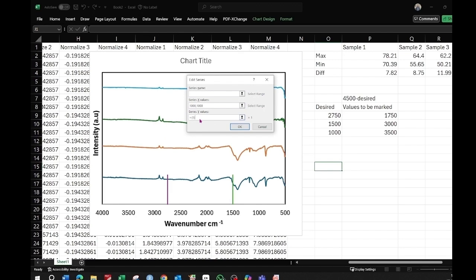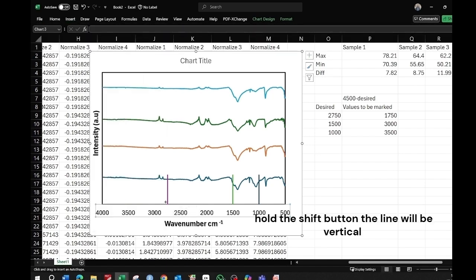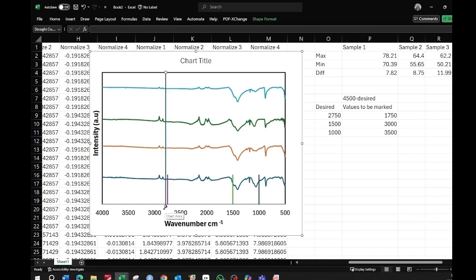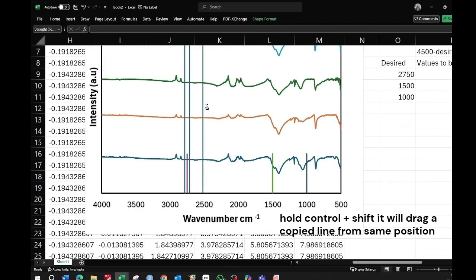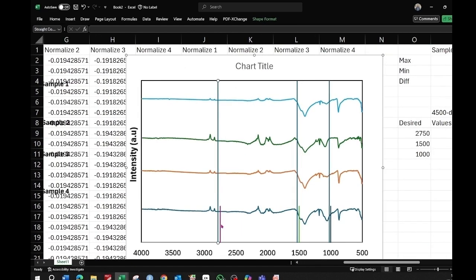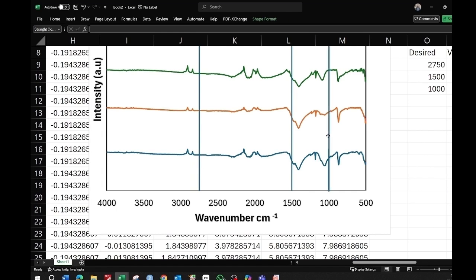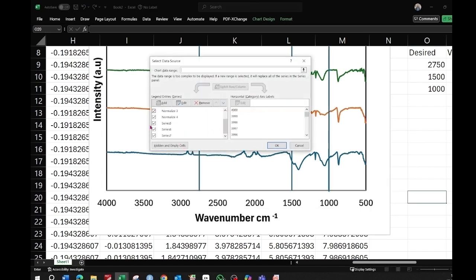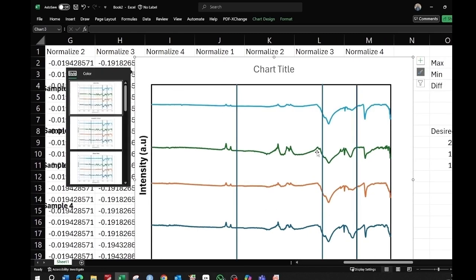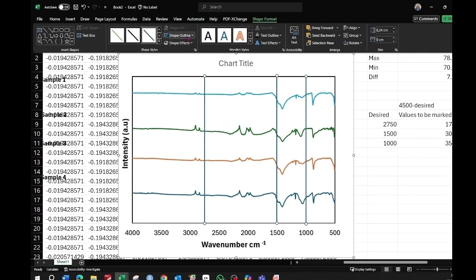Go to Insert, choose the Shape option, select the single line, and drag it vertically while holding the Shift button to keep it straight. Zoom in to confirm your line starts from the axis. Press Ctrl+Shift and drag to copy lines to all three positions. Select each line and drag it to the top of each corresponding marker line. Then select the y-axis, choose Select Data, and uncheck series 5, 6, and 7 to remove the temporary data series — leaving permanent lines at your desired wave numbers.